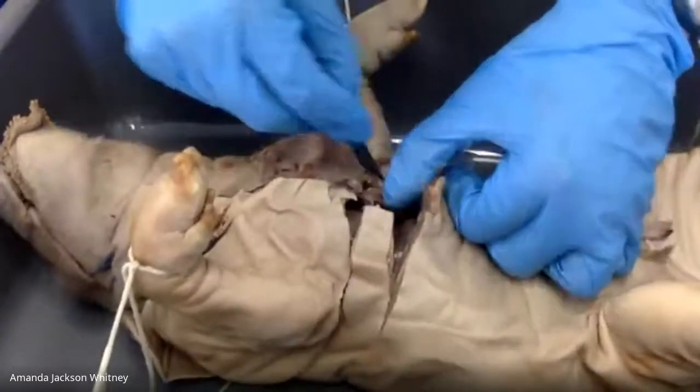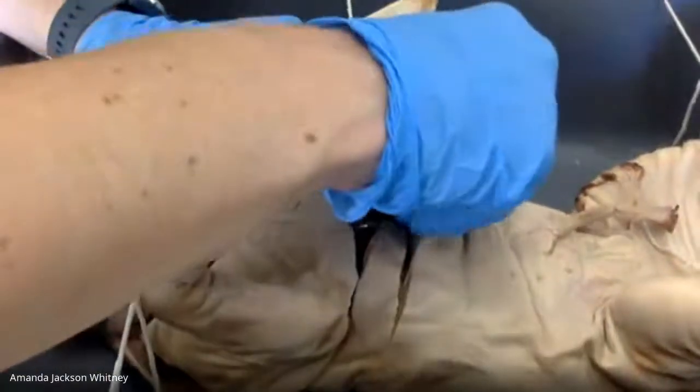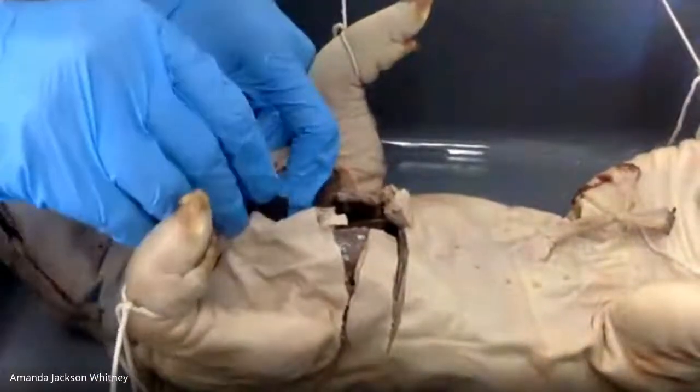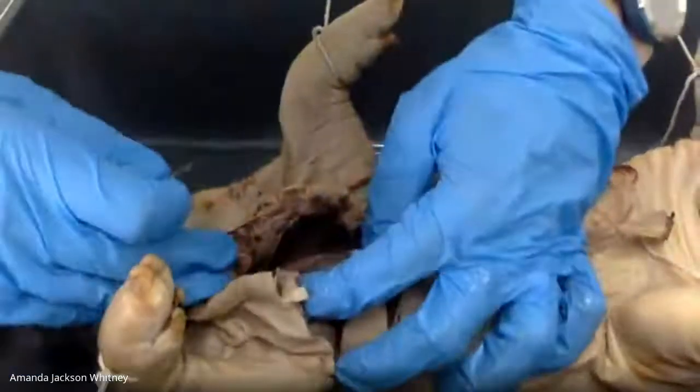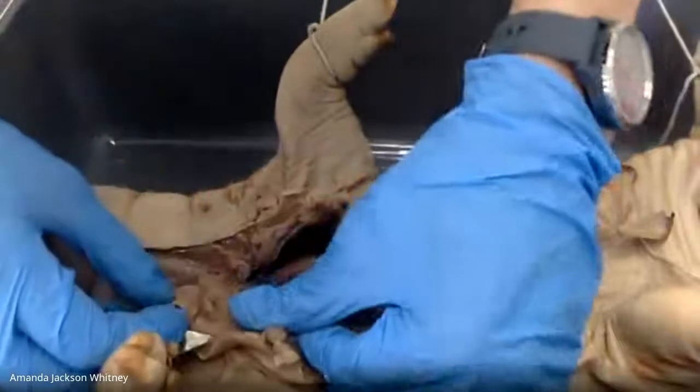I know it's not ideal to see. If you guys can put me on speaker view, I think that's what it is, and you'll be able to see a lot better. If you're like, this is really hard to see, try and get most of the screen on me. Okay, we are getting there, everyone. We're about to take the heart out.